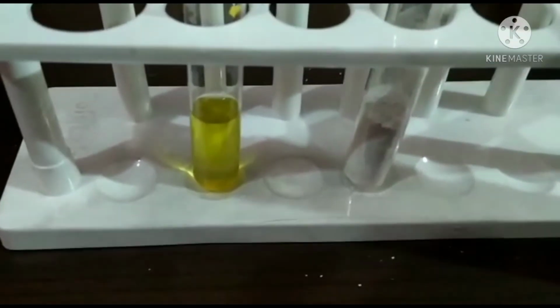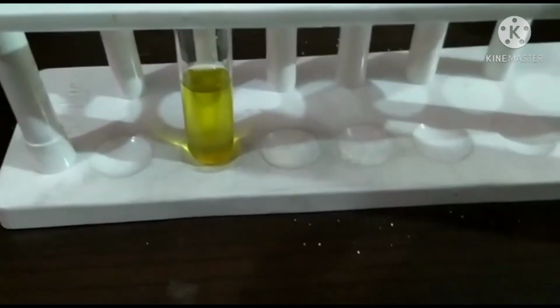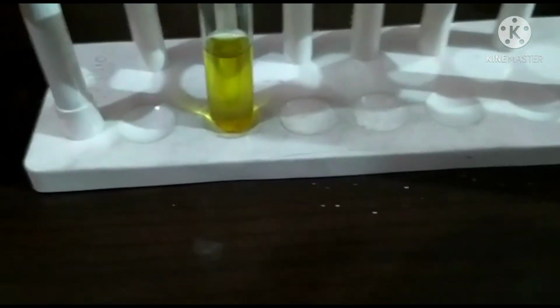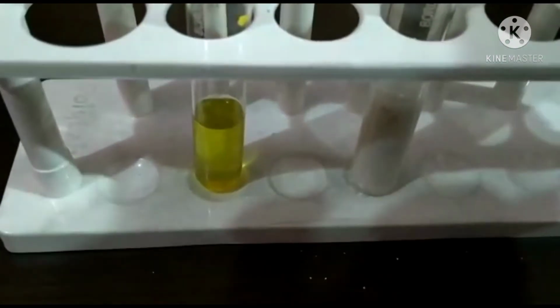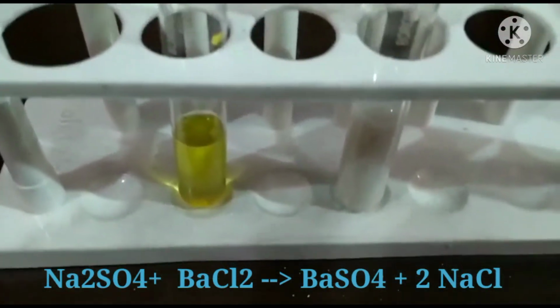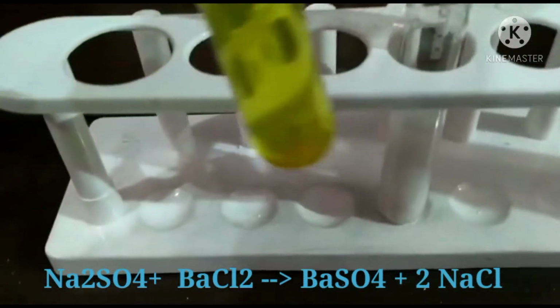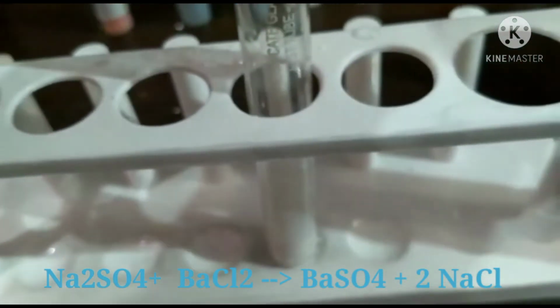I think we have taken more than required. Now we will add water to the barium chloride to make it a solution, and now we will mix both these solutions. I am adding sodium sulfate to the barium chloride.